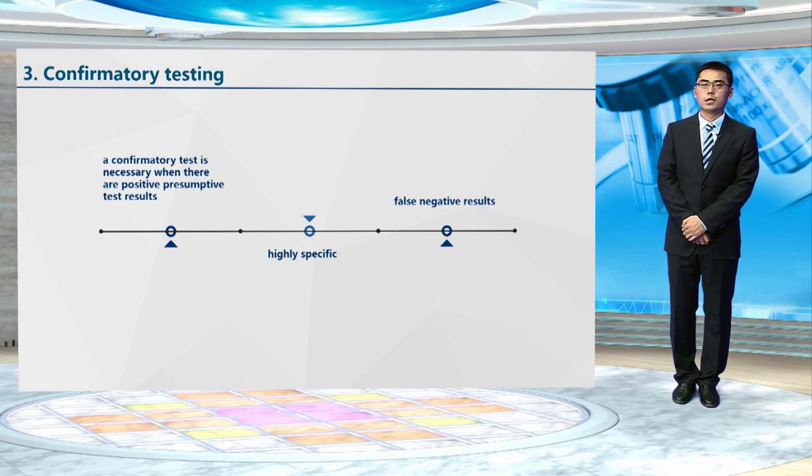Alternatively, a positive crystal test for the presence of certain heme derivatives or the demonstration of the characteristic visual absorbance spectrum of hemoglobin is regarded as conclusive proof of the existence of blood.